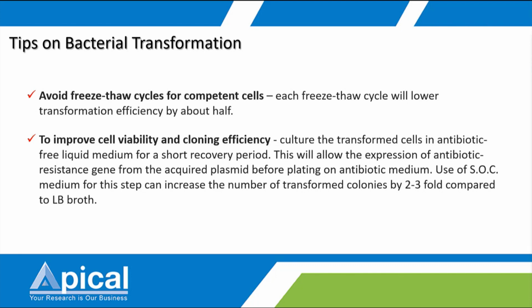Then you put this 500 microliters into the culture bottle and culture it again. So the 500 microliters of culture can be antibiotic free, for the cells to recover, and only then do you culture it in medium that has antibiotic.